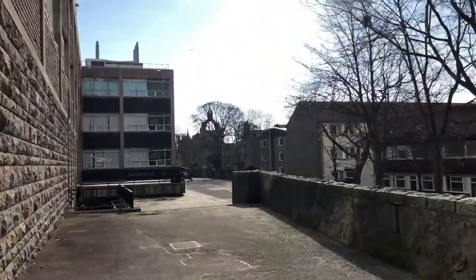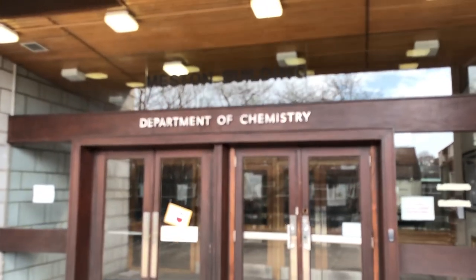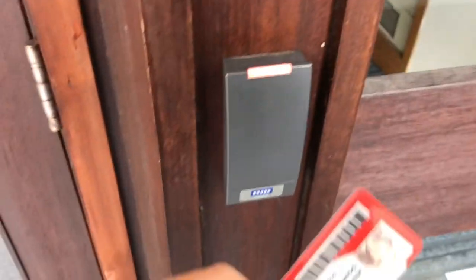Hello and welcome to my video. This video is just kind of an introduction to the sort of things that I do in the lab, and I'll just be giving you a little tour around the lab where I do my work, so you can see what a chemistry PhD student does on a daily basis.